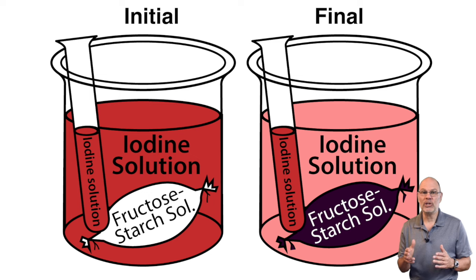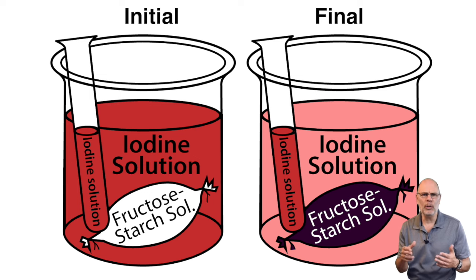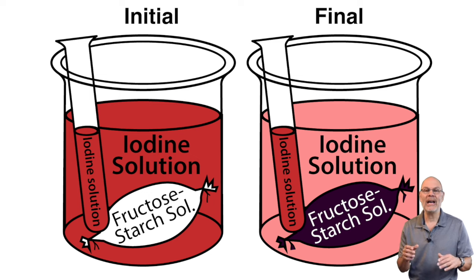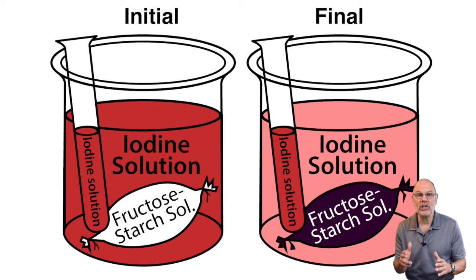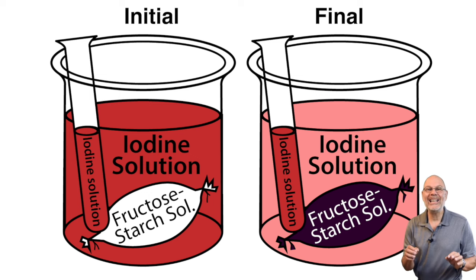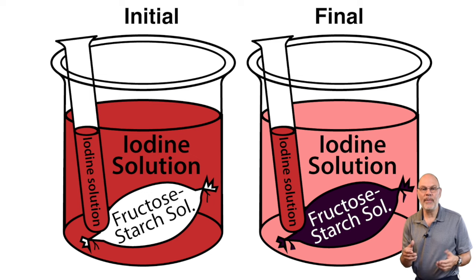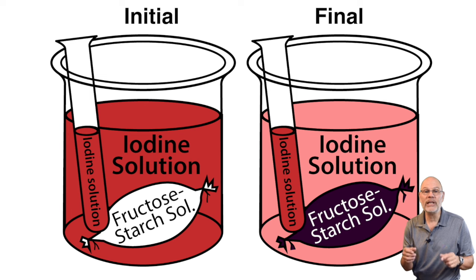The bag is not permeable to starch. We know that because when starch and iodine meet, the solution turns this purple-blackish-bluish color. But that color change is only seen inside the bag. If the bag was permeable to starch, we'd see that color change outside the bag — and we don't. So the starch couldn't diffuse down its concentration gradient; it was stuck inside the bag. On the other hand, the iodine did diffuse from the cup into the bag. That's why there was a color change inside the bag, so we can conclude that the dialysis tubing is permeable to iodine.